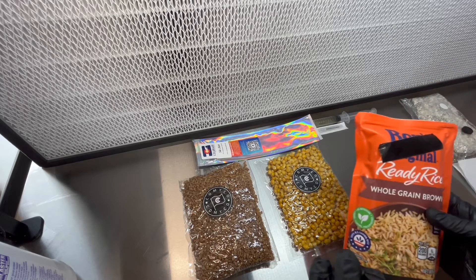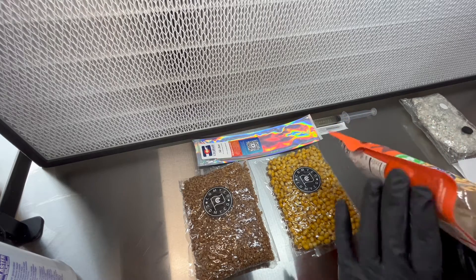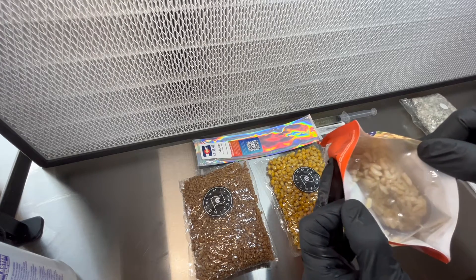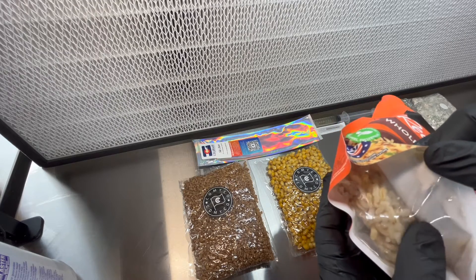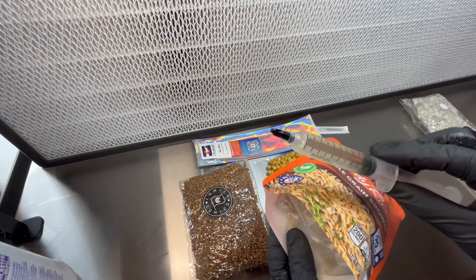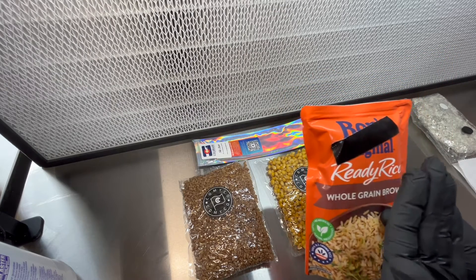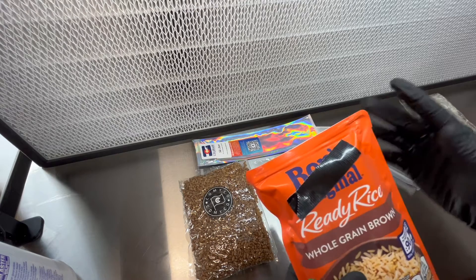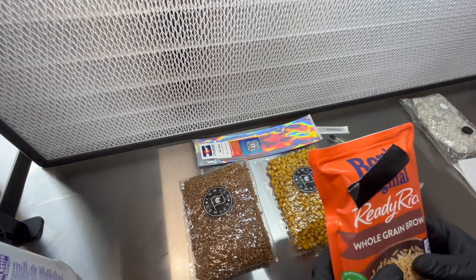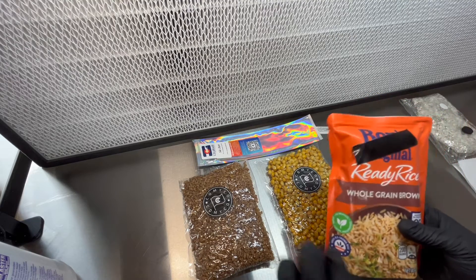However, there are some pretty big issues with this. And if you are a big fan of this method, nothing against you — I totally get it. But you can only really see what's going on from the bottom. And also when I look in there, I notice that this rice is really wet, and that can be a big pitfall for beginners if they put too much LC in there. You don't want to drown your mycelium in liquid. And you can't see what's going on in here.